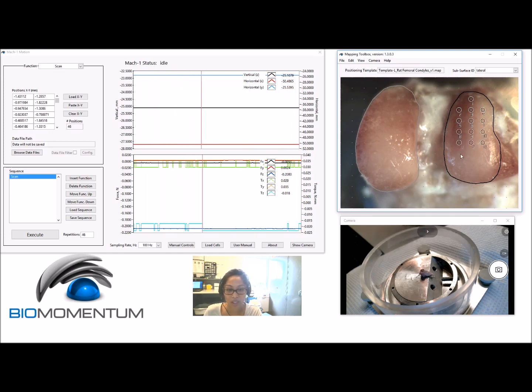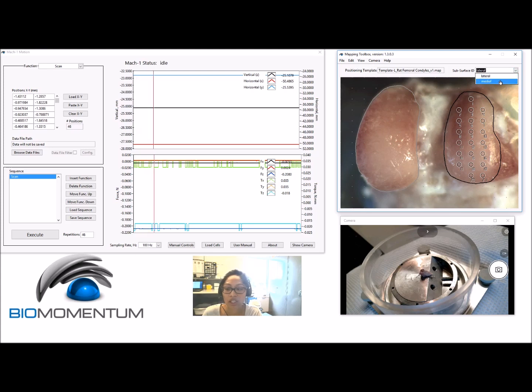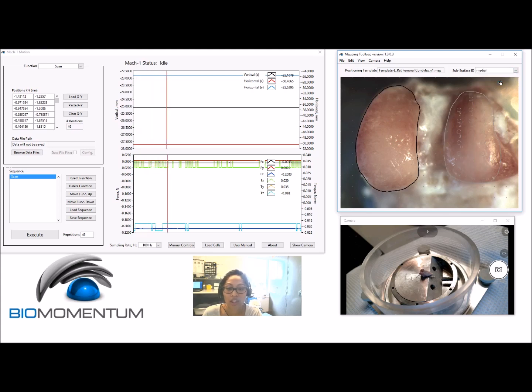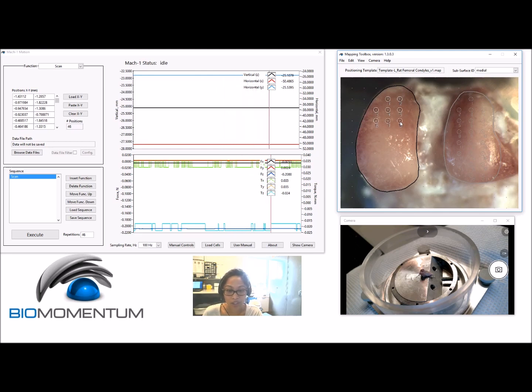If necessary, choose Delete Position in the Edit menu of the menu bar and click in the camera feed at each position that is not overlaid on a location of interest. The position will then be deleted from the camera feed.